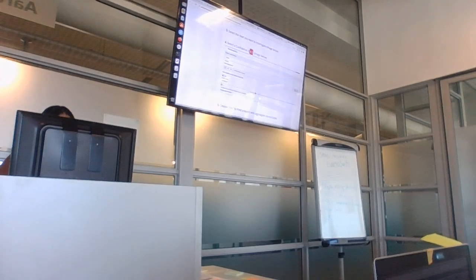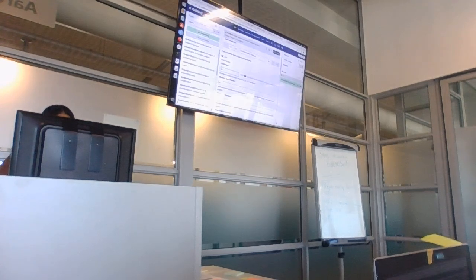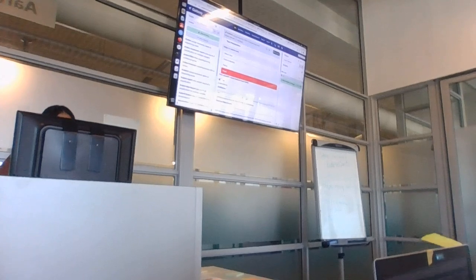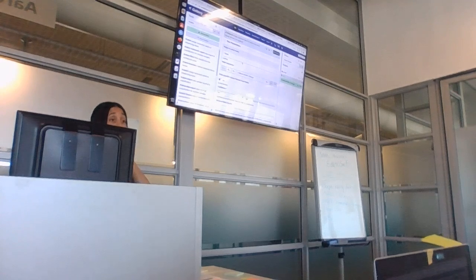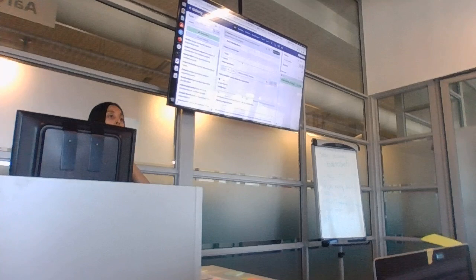Here by the confidence. Please, is that single read or one sample? Yeah. Which one is it? The single read. Forward only? Hmm? The other forward only or the single. So you choose either. Yeah. Or the reverse. She chose this one because the GC was 60%. Yeah, but then that's the whole sample. You can choose forward or reverse. Did you upload the reverse? But I sent the forward in the NGS.